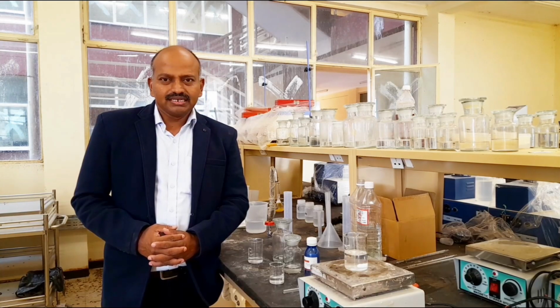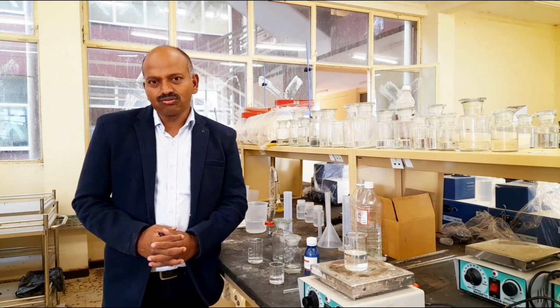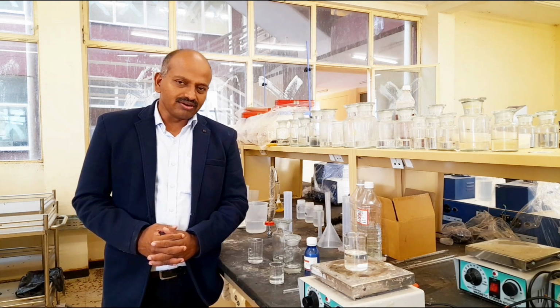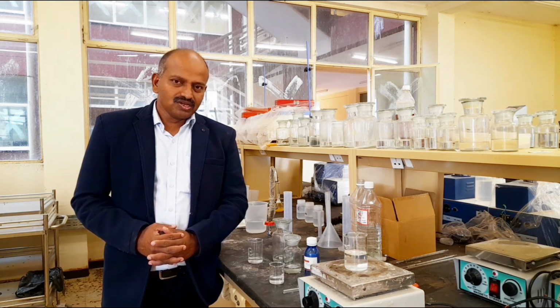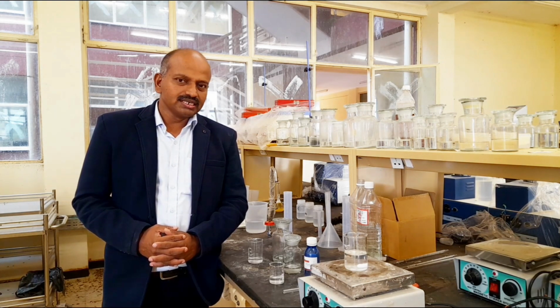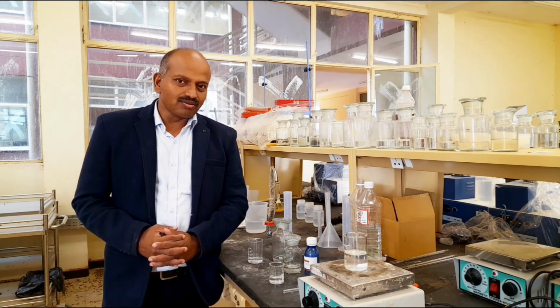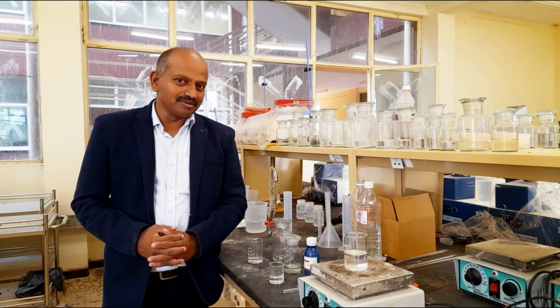We will see the other two titrations carried out by the students, because we have to take three consecutive titrations, and the value should be the same. So let us perform the other two titrations with the students and find the value, which is 14 ml, that is accurate. Let us see the performance of the students from the Chemistry Department of Kabridahar University.